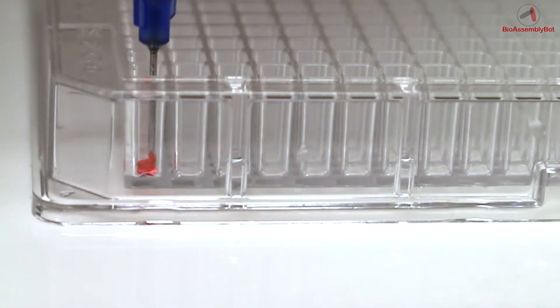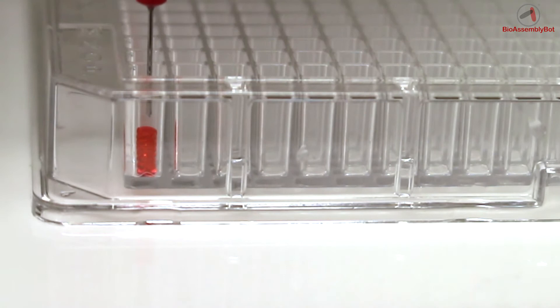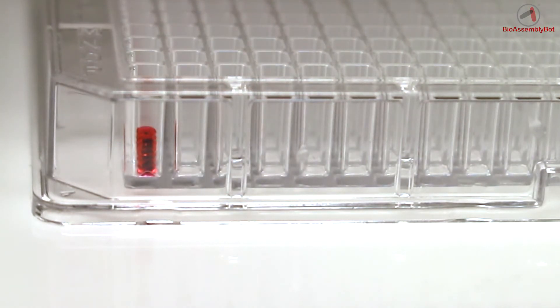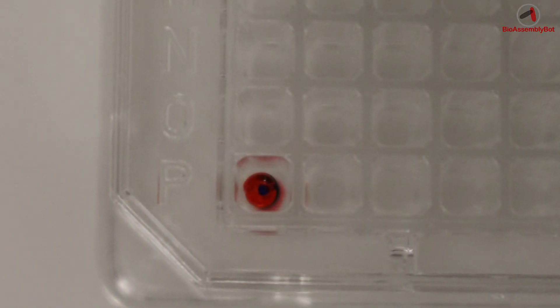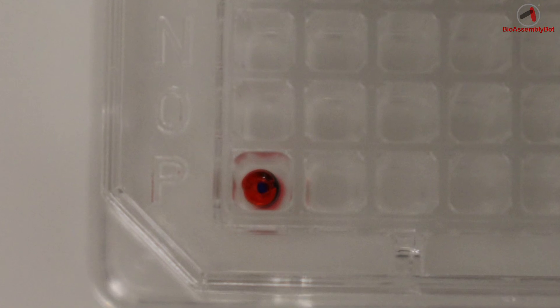Finally, TSIM and BAB construct a two-compartment cell scaffold system, first involving a hollow cylinder print shown here in red and viewed from the top, followed by a deposition of a second cell matrix material in the center of that cylinder — all done within a single well of the 384-well plate. Shown again here at the top view with the blue central compartment into the red compartment.